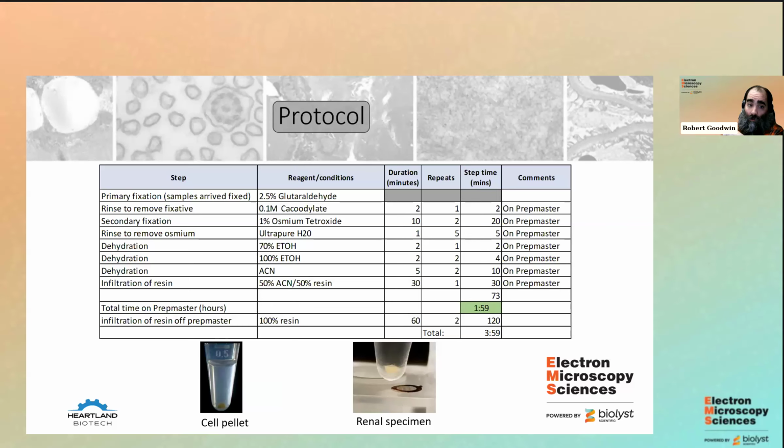This is my protocol that I use. As you can see, this whole run takes about 2 hours, and that is from receiving. We receive ours in fixative already, because we get them from different sources. So that's from the first stage buffer all the way through to my 50/50 resin.